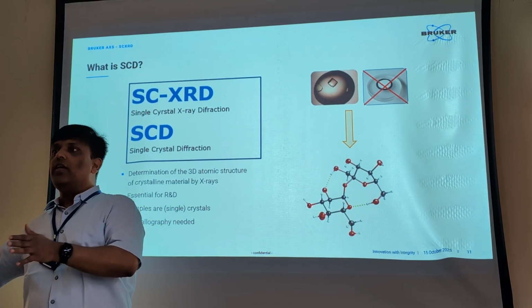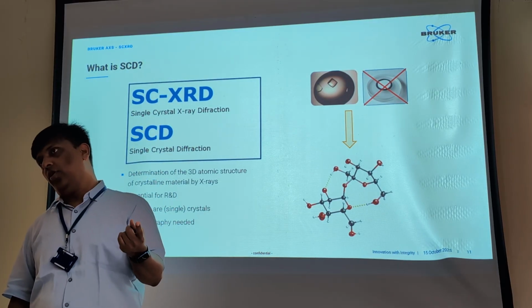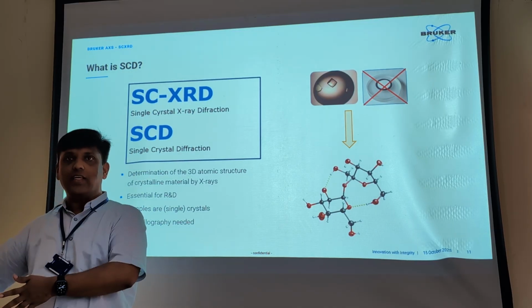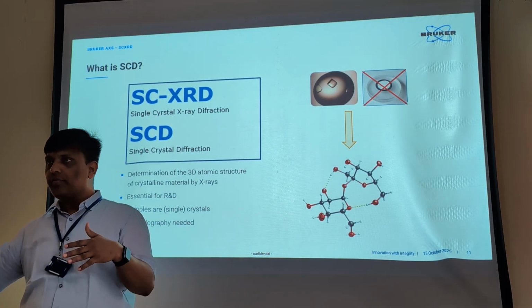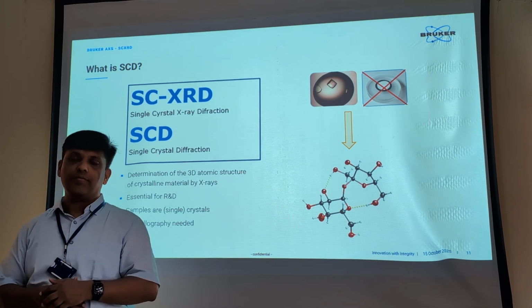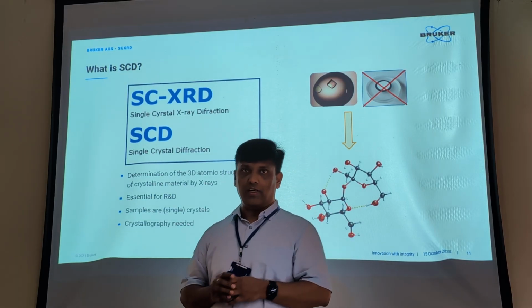If it is a polycrystalline material, you need to do it on a regular XRD, and you will get only phases and quantification. But if you have a single crystal, you can put it on this instrument and really do the structure solution.